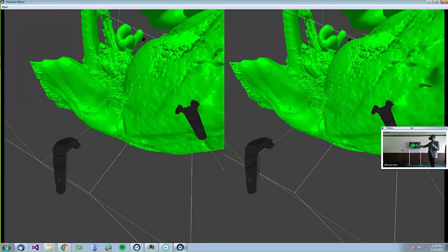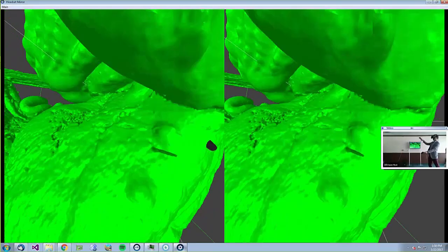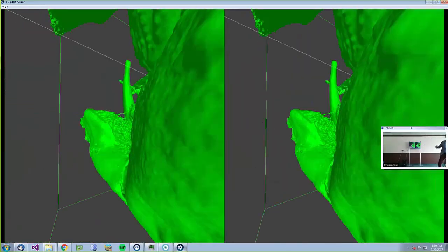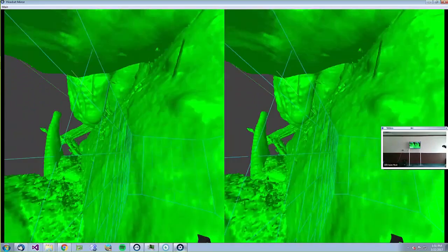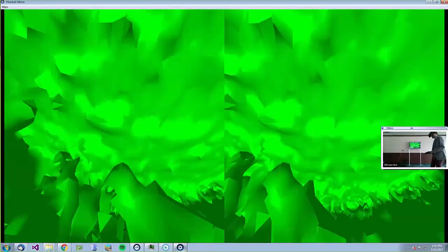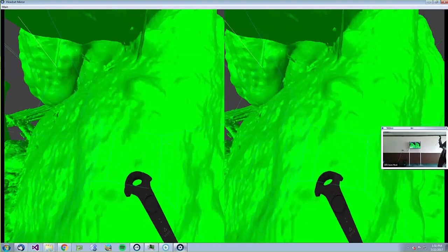Now he is probably 3 times my size, 4 times now, maybe 5 or 6 times. He certainly doesn't fit in the room anymore. So if you have a bit of vertigo like me, this is... And you're getting crowded out by the embryo, looks like. So now he's actually occupying most of the space.